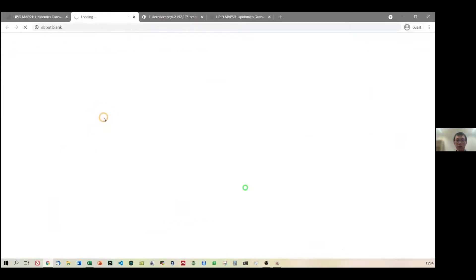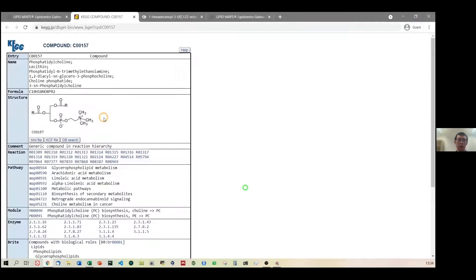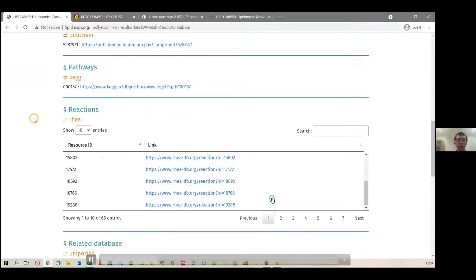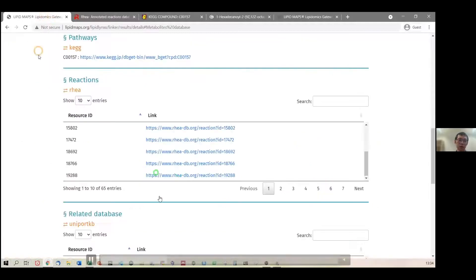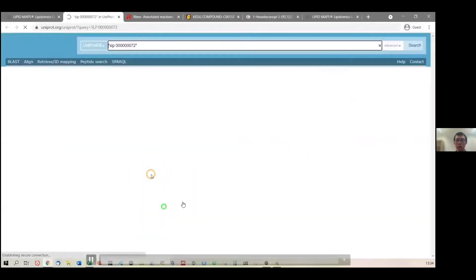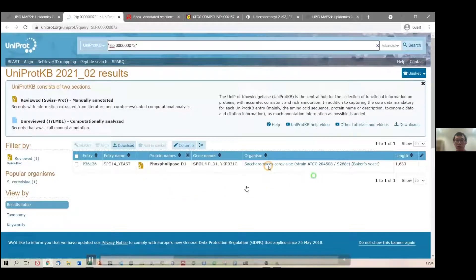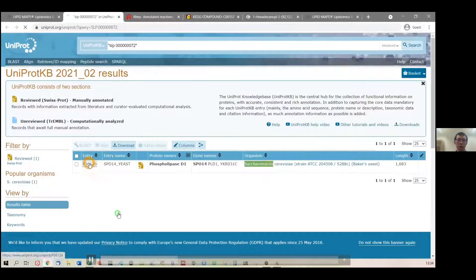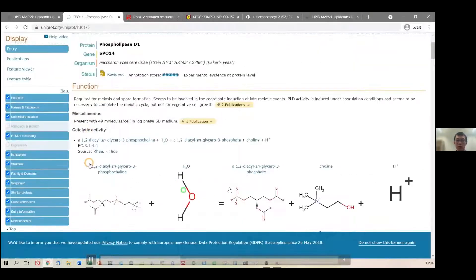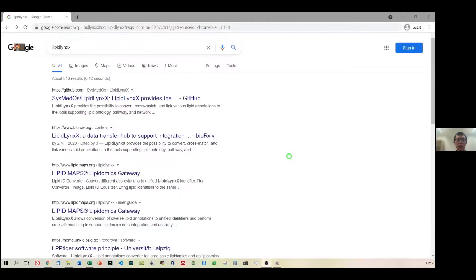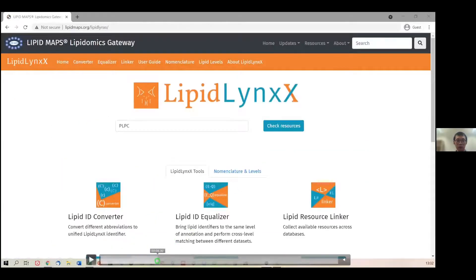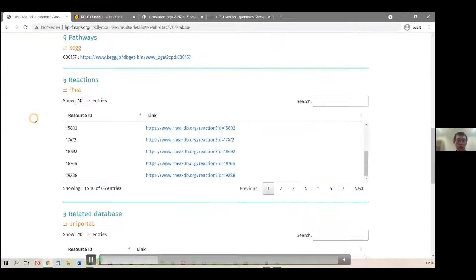You can also go to KEGG pathways, which opens the KEGG pathway website where you can check related pathways. There are Rhea reactions showing reactions from phospholipids to lysophospholipids. You can also link to UniProt KB to see protein names and organism species, and click to get the enzymes corresponding to the reaction. This is a fast overview of how the fast search works.